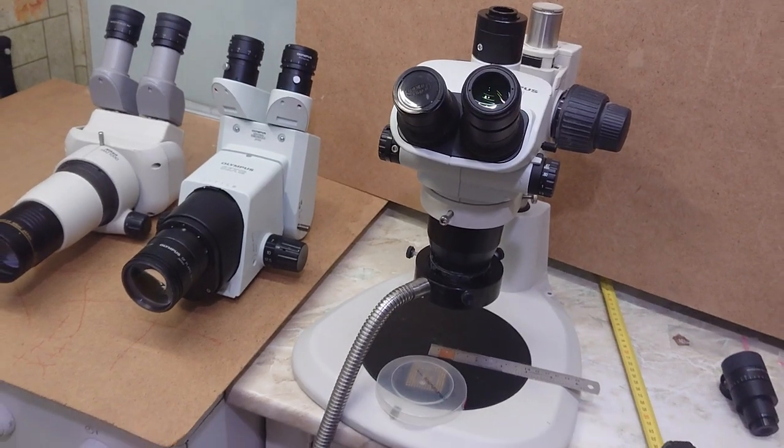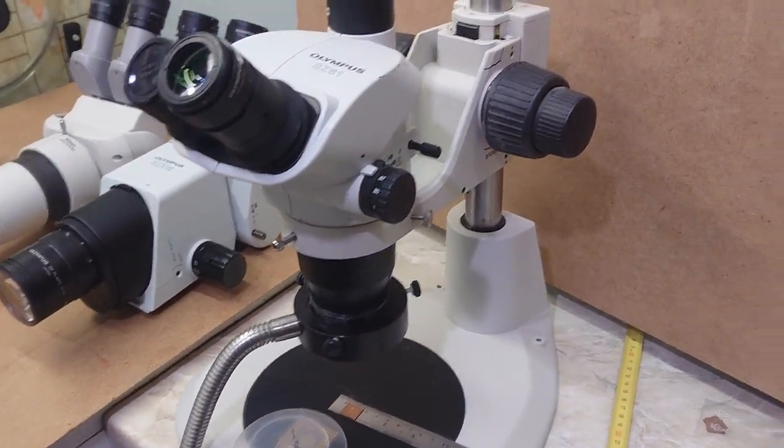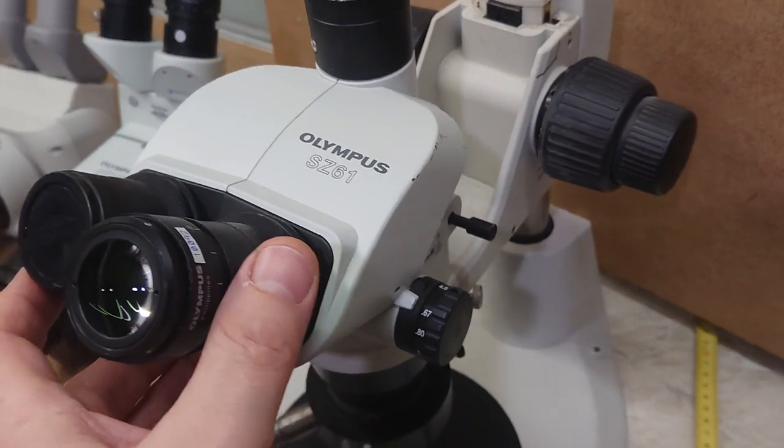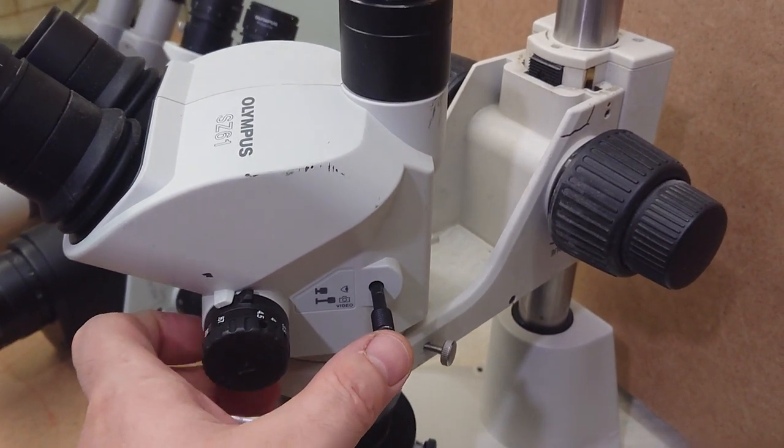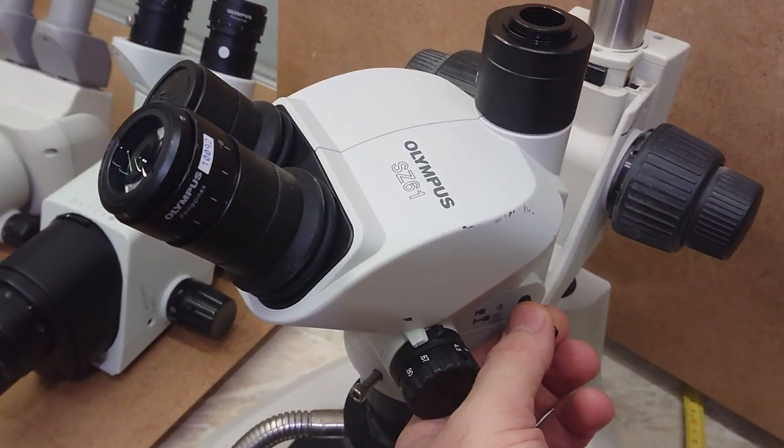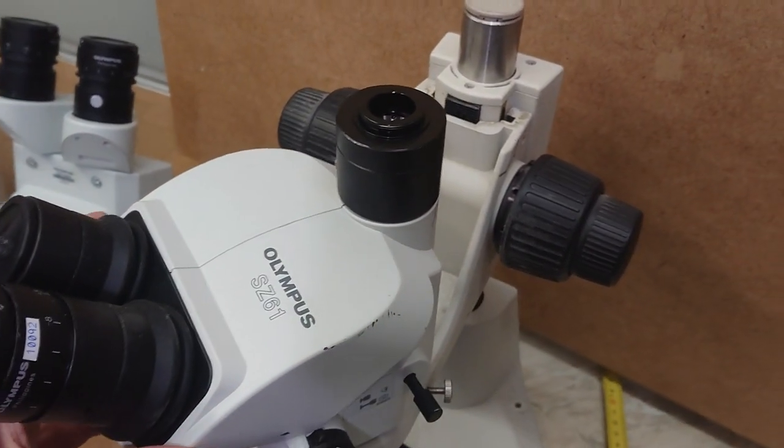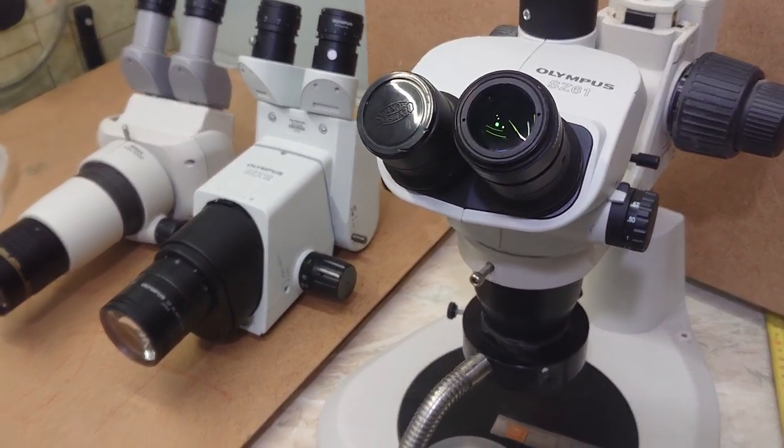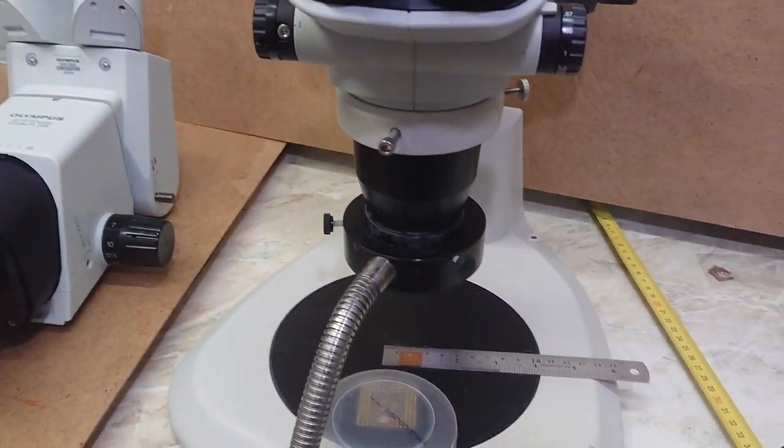So we need to check resolution, but by the way we can see common ergonomical properties of those microscopes. The first microscope I've taken into consideration is Olympus SZ61TR model that has a trinocular port. When this port is activated, the right channel is getting blind and all picture from the right channel goes to the port while the left channel is still open. I won't use the left channel for our comparison so far because I need just to see base information on the microscope, so let's just see how it works.